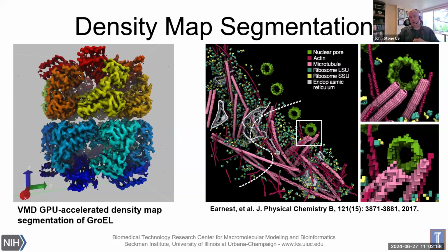Once you can refer to those things, now you can refer to particular subunits of a structure in that density map. And you can use that to do more targeted analysis, like how does that part of this density map fit with the crystal structure? Are they well aligned? Is there disagreement? Can I identify a particular region of space where those are poorly docked or poorly aligned and so on? So those are all things we can do using density map segmentation.